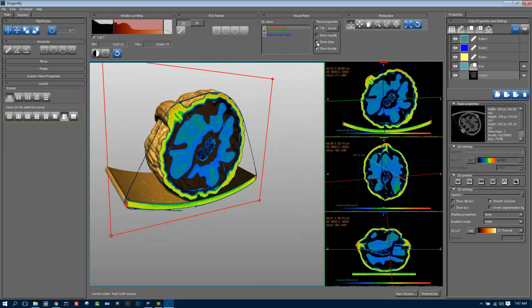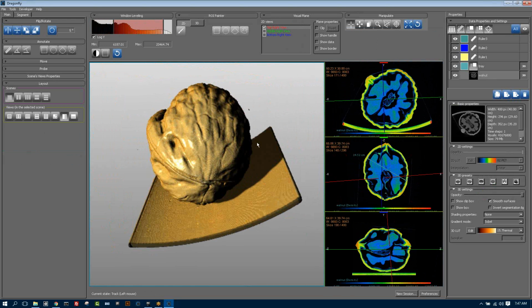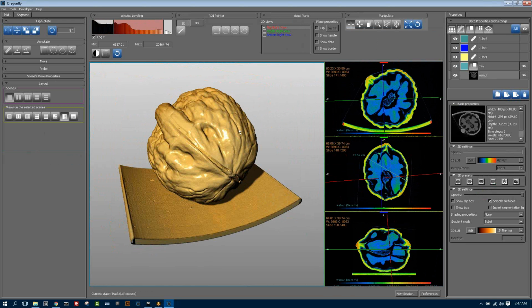Okay, I think that's enough in the way of background for showing the general purpose. Now I want to talk very briefly about segmentation before I go into quantitative analysis.